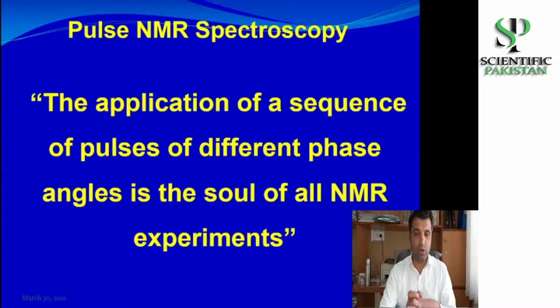As I've told you earlier, NMR is a very vast technique, and it has a lot of different techniques within it, and all of these techniques differ from each other by the sequence of pulses. So the application of these sequences of pulses of different phase angles is the soul of all NMR experiments. We have different experiments, and each of them differs from the other by the pulse sequence.